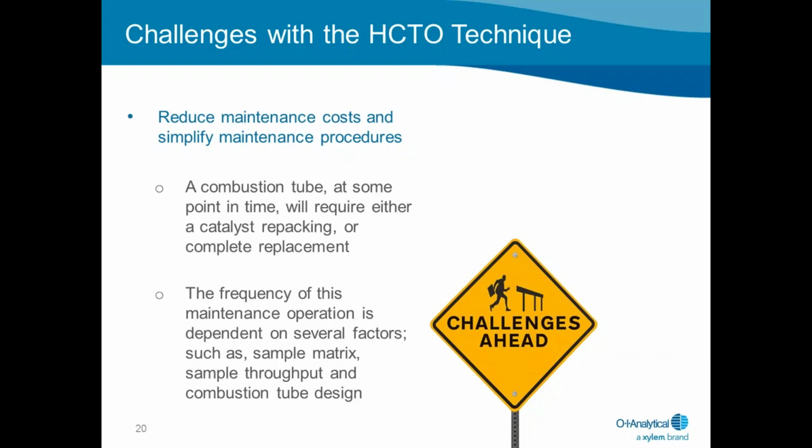However, in some cases, complete replacement of the combustion tube may be required. As you recall, previous slides looked at the combustion tube that was showing the effects of devitrification. Eventually, if we continued analyzing salt samples, that combustion tube will have to be replaced. This is particularly true for the analysis of salt-containing samples.